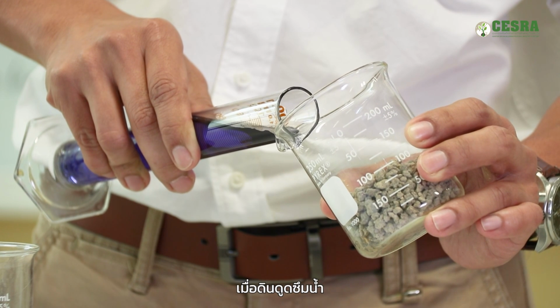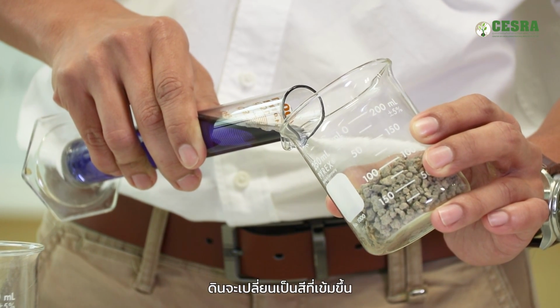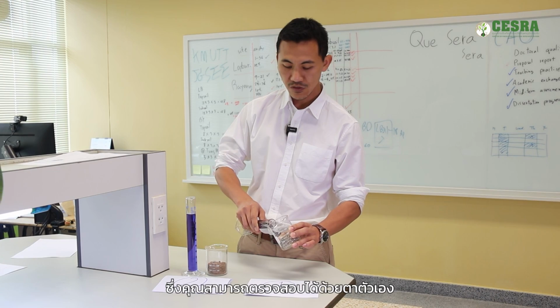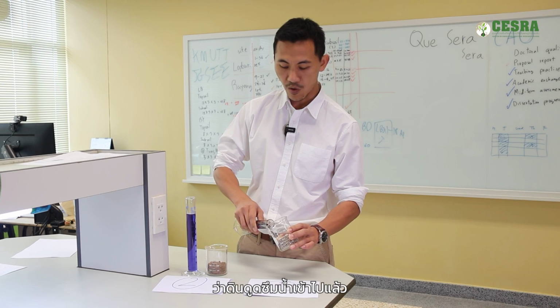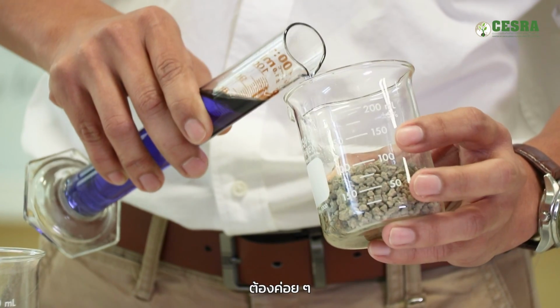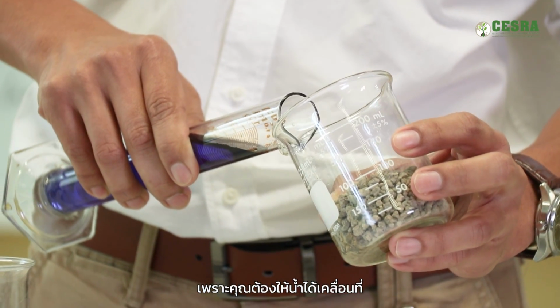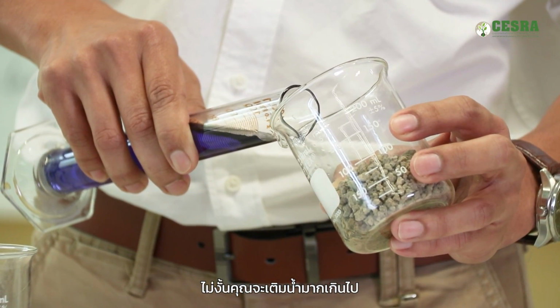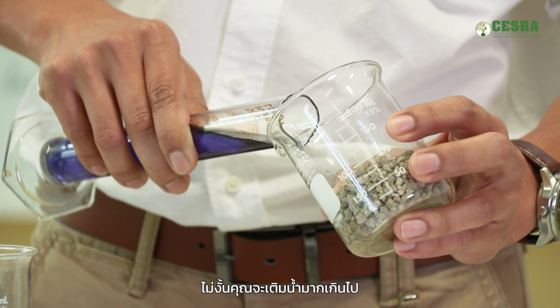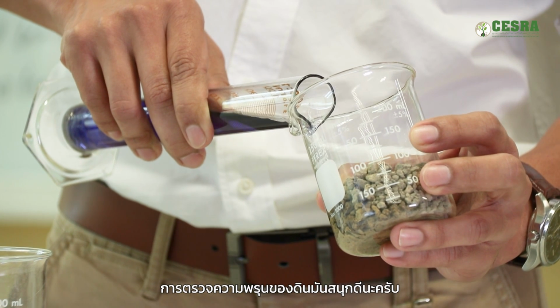Once the water is absorbed by the soil, the soil color changes to darker, right? So you can check with your eyes that the soil has already absorbed water. Okay, done. Just wait a little bit because you have to let the water move. Otherwise you add too much water. You can play this with your kids as well. It's really fun to check which soil has higher porosity.